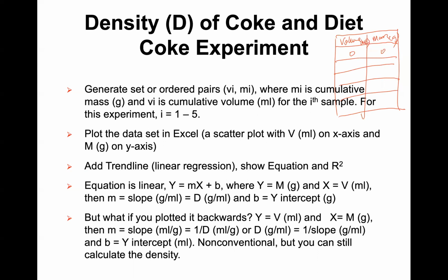For example, here we will use water, measure water, right? You don't have water added to the flask, and so the mass is 0. Now, we will use a flask like something like this. Make sure you weigh this first, then add later on. Or you can do another way: put this on the balance and arbitrarily set this overall as 0.